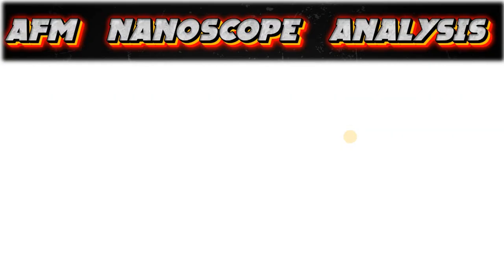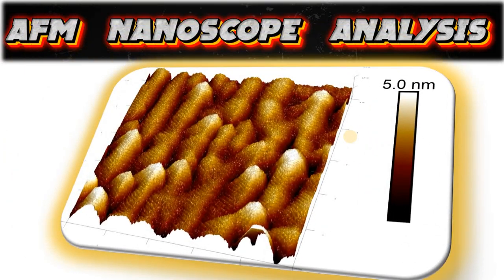Today I will be demonstrating how to analyze atomic force microscopy data using Nanoscope Analysis software. This powerful tool allows researchers to visualize two-dimensional and three-dimensional surface maps, characterize surface properties such as roughness and texture, and make precise nanoscale measurements.